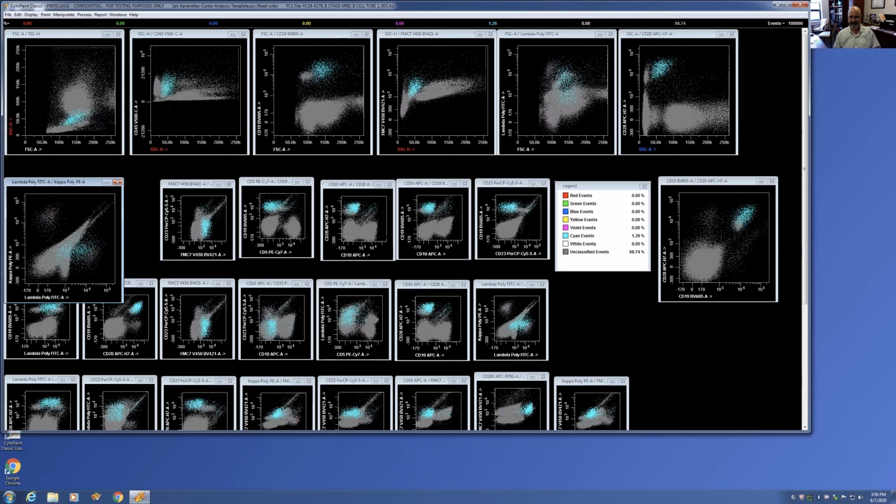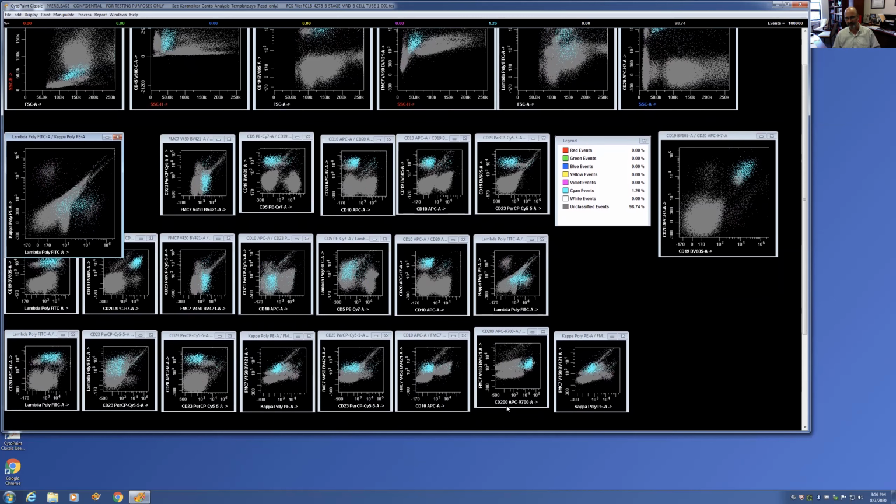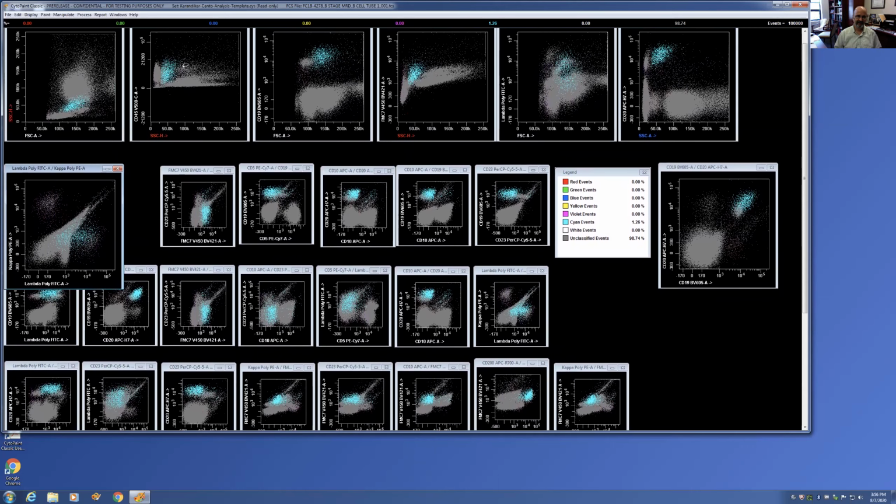I haven't cleaned this up very nicely because we are rushing through the case. But here's a 5 negative, 10 negative population. So none of the other markers matter as much in this scenario. I mean, yes, it is CD200 positive, but it's not a CD5 positive in the first place. So 5 negative, 10 negative, what's your differential? A marginal zone lymphoma, a lymphoplasmacytic lymphoma, and a hairy cell leukemia. And there's something about, you know, not having monocytes here, the weird scatter of these cells.